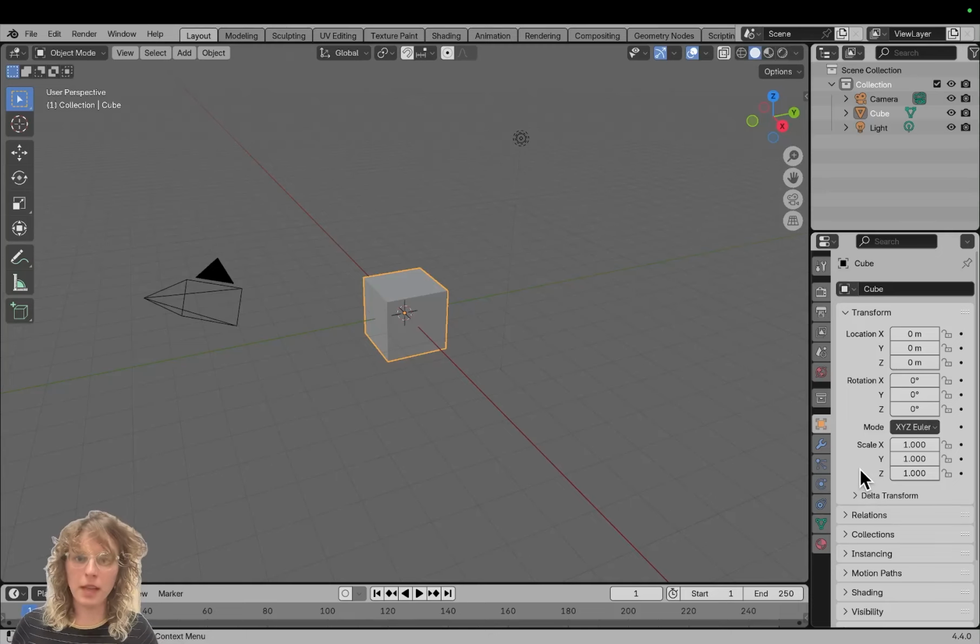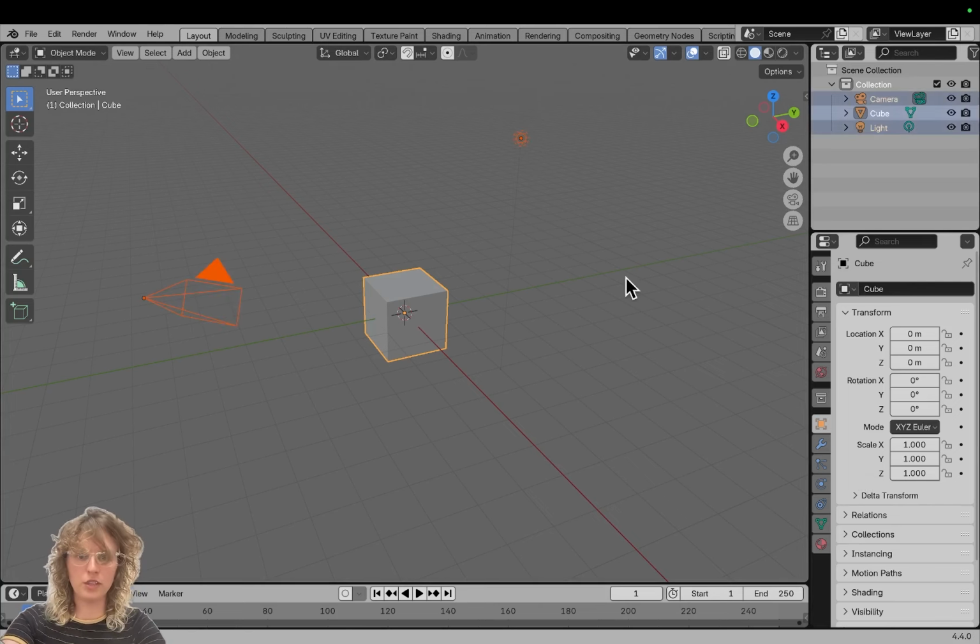Here we are in Blender, and Blender is a very powerful rendering tool, and we can now load some electron microscopy data with Microscopy Nodes into Blender. So for that, we first want to delete everything that is preloaded in the scene, and we do that by first tapping A and then tapping X.